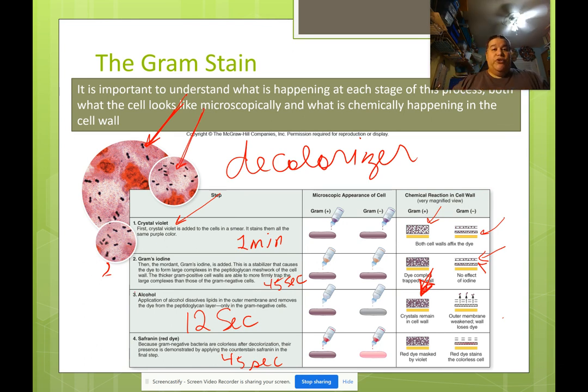This procedure, this staining process, is a huge, or was a huge leap forward in microbiology because without us having to do any type of genetics or anything else, we literally could tell the difference between gram negative and gram positive using this basically 4-step procedure.